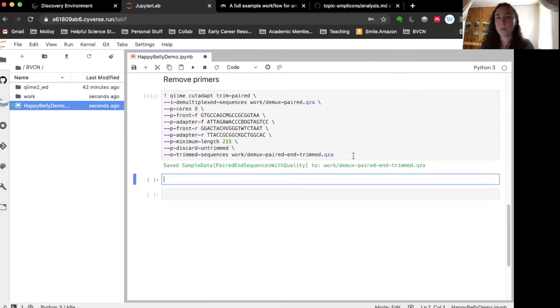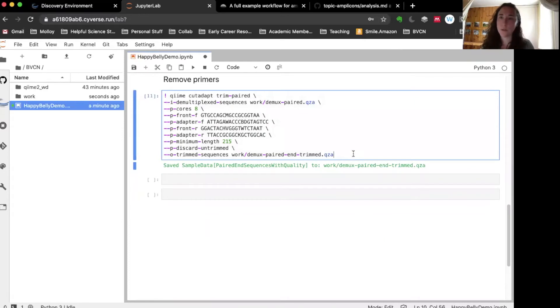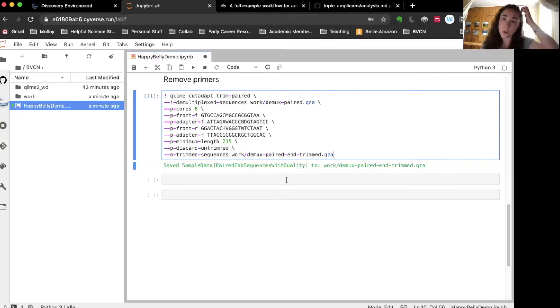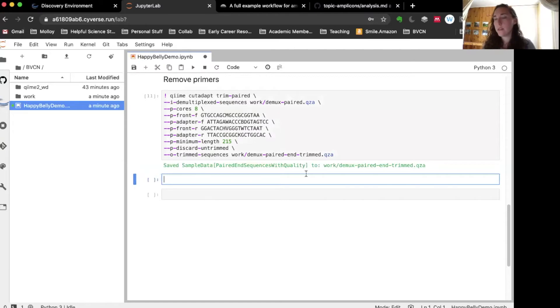One option I didn't mention is 'verbose', which will output the results of the trimming step showing for each FASTQ file what percentage of sequences were trimmed and how many were thrown out based on parameters like minimum length. I didn't put that option here because it'll make the notebook messy, but if you're trying this on a new dataset you should definitely check out those files and make sure this is functioning correctly.